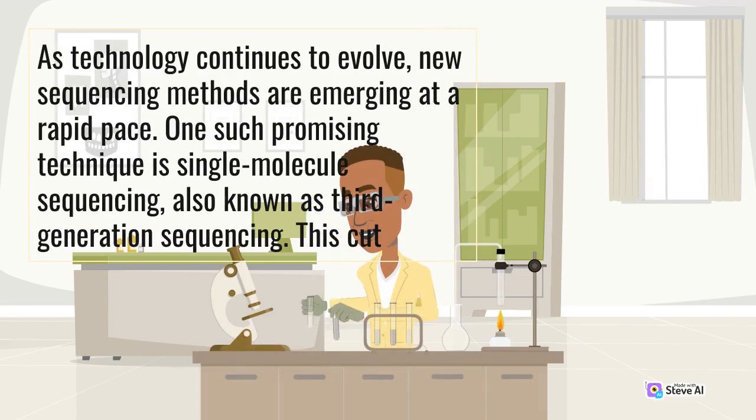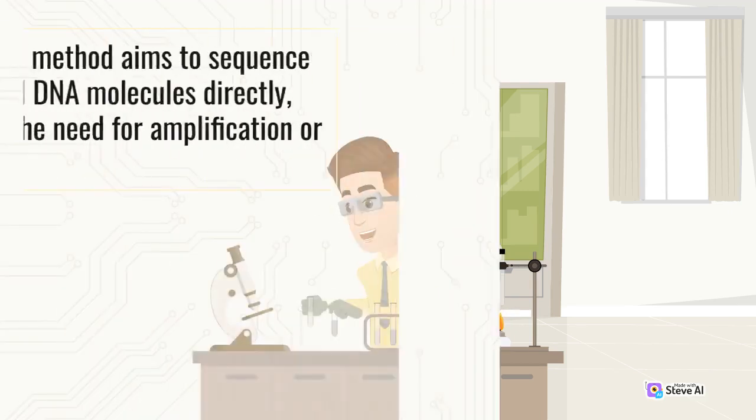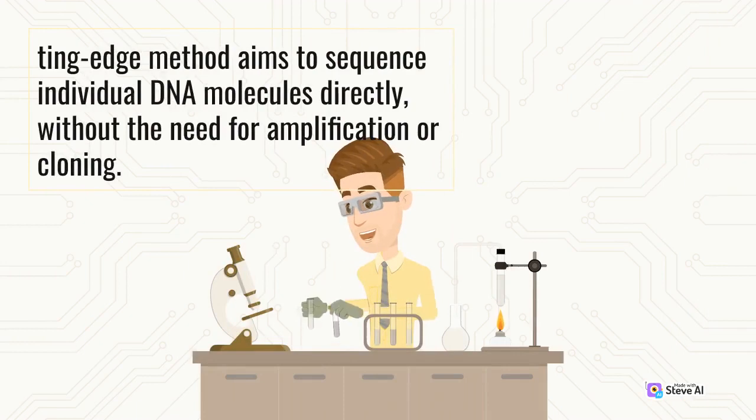As technology continues to evolve, new sequencing methods are emerging at a rapid pace. One such promising technique is single-molecule sequencing, also known as third-generation sequencing. This cutting-edge method aims to sequence individual DNA molecules directly, without the need for amplification or cloning.